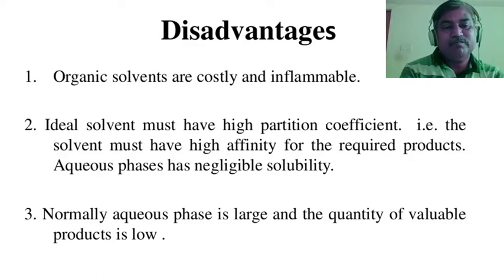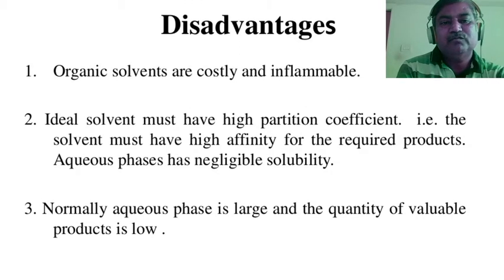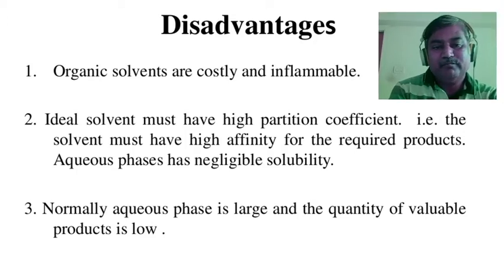Second thing, during this process, as the solvents are inflammable, automatically you have to take precautions, that is, the system should be conducted free from fire area. Okay, so this is the first disadvantage.